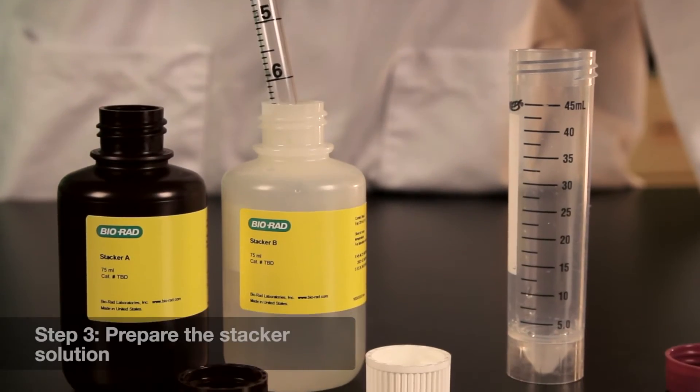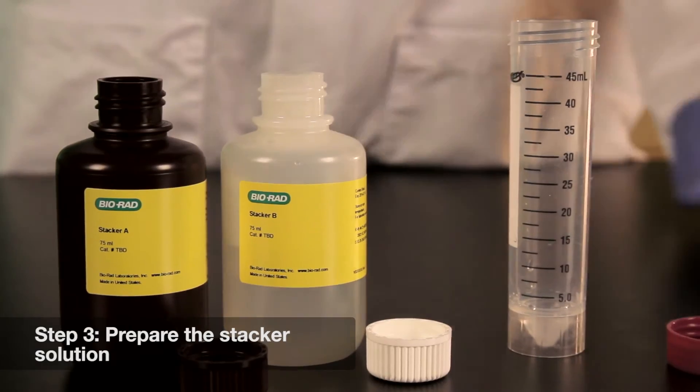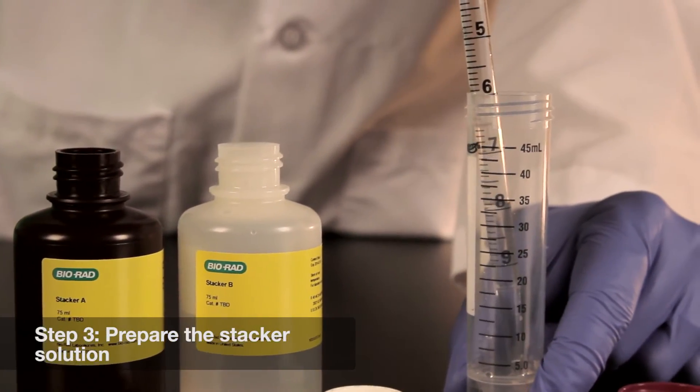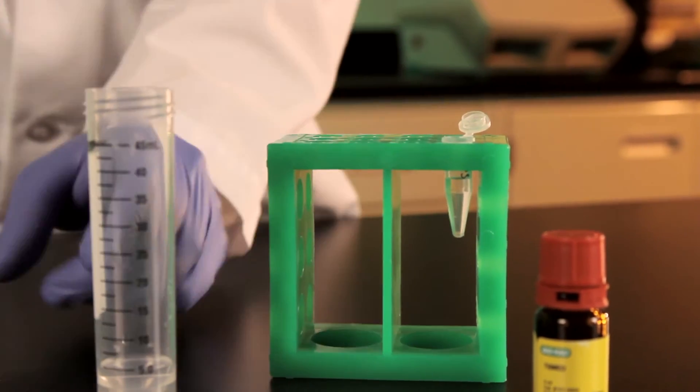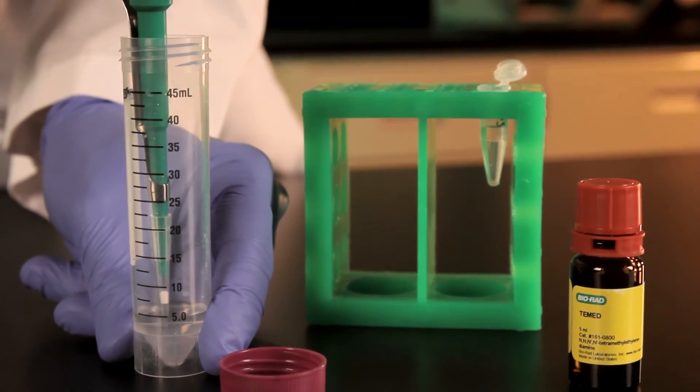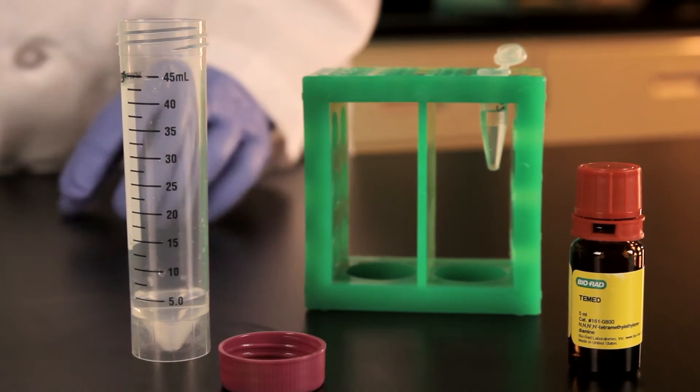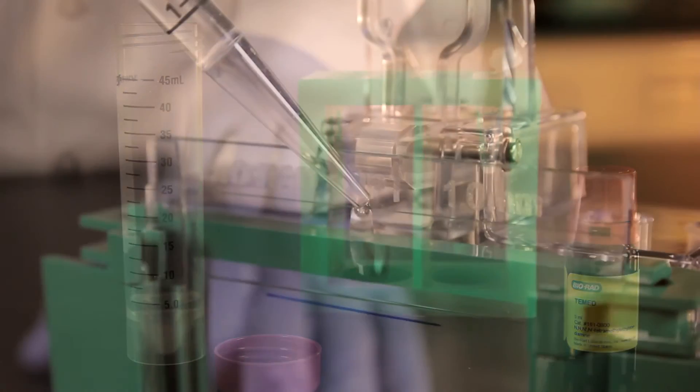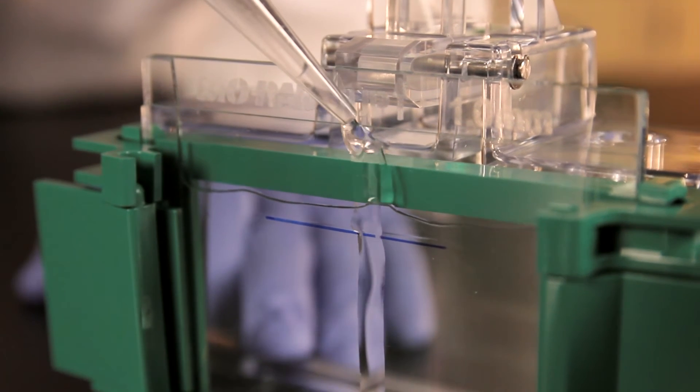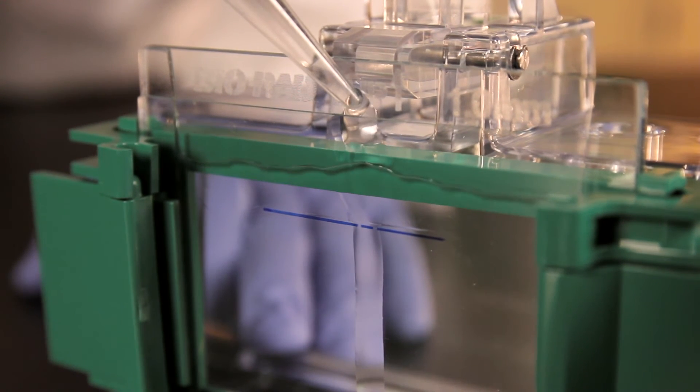Prepare the stacking gel acrylamide solution by combining equal volumes of the stacker A and B solutions. Add the appropriate volumes of TEMED and freshly made 10% APS to the combined stacking solution and mix thoroughly, again taking care to avoid introducing air bubbles into the solution. Pour the solution slowly down the middle, completely filling the cassette.